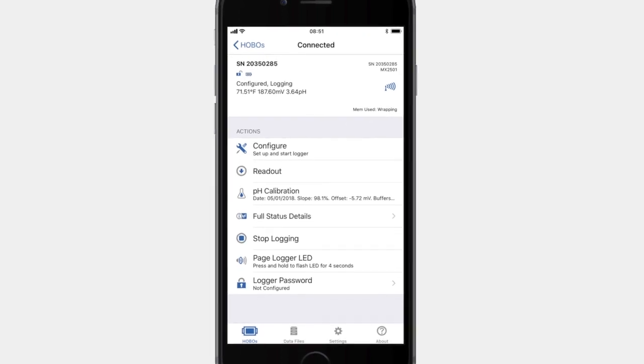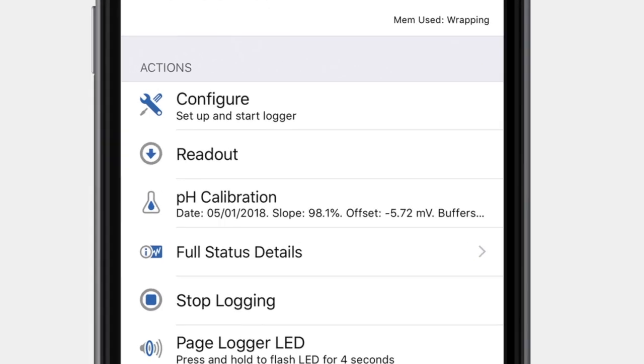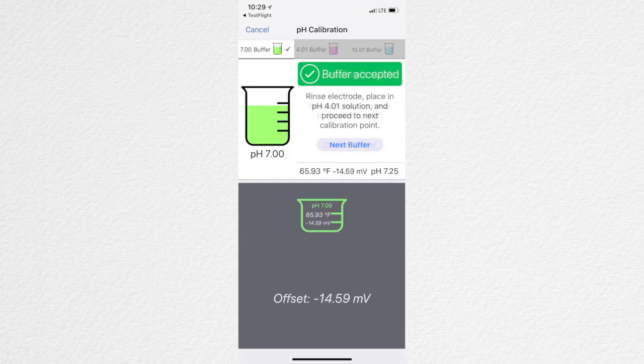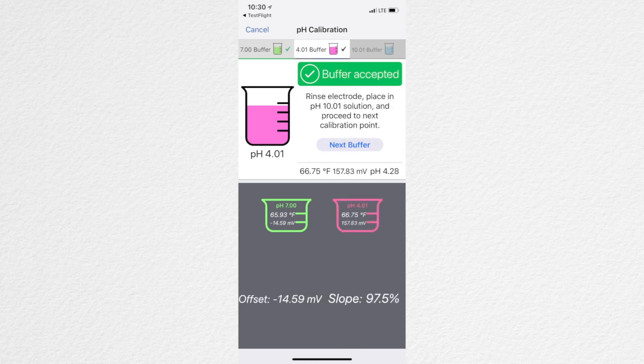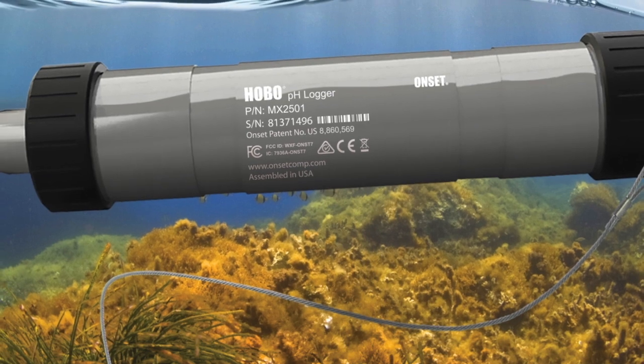The app's built-in guided calibration feature seamlessly walks you through the pH calibration process. Simply follow the on-screen prompts and choose a two-point calibration or a three-point calibration using standard pH 4, 7, and 10 buffers to obtain a temperature-compensated calibration, as well as information about the electrode's condition.